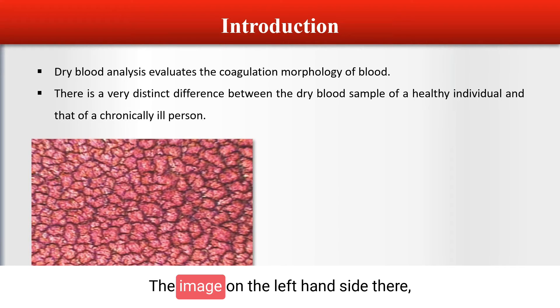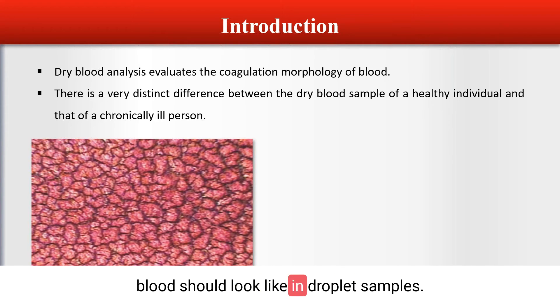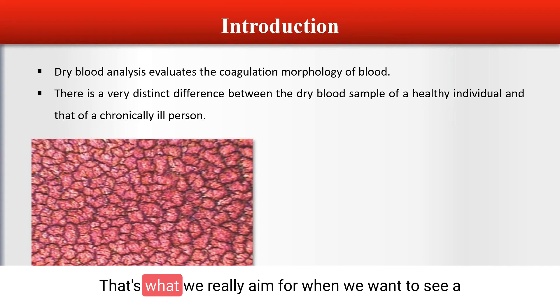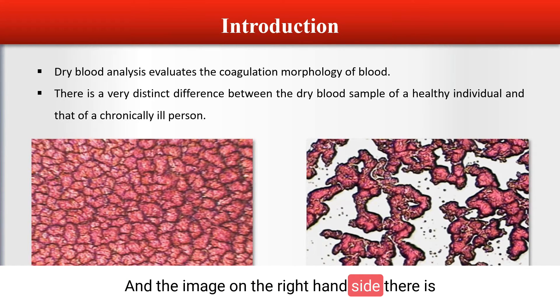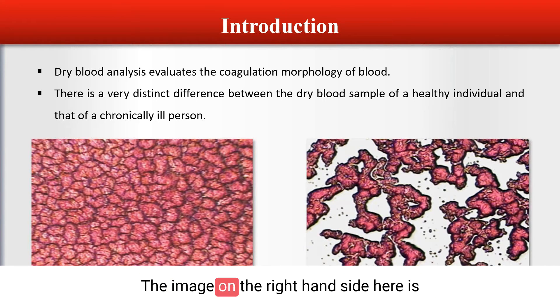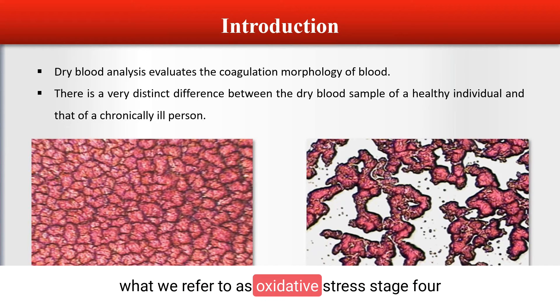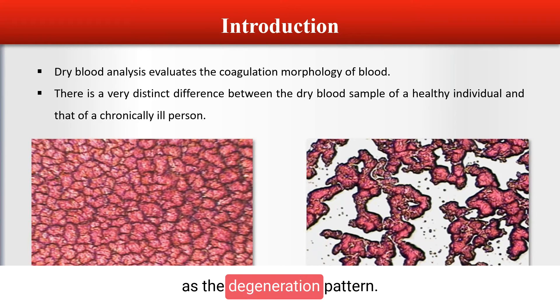The image on the left hand side is a very good example of what normal blood should look like in dry blood samples — that's what we really aim for when we want to see a healthy dry blood image. The image on the right hand side is at the other end of the spectrum, referred to as oxidative stress stage 4, or the degeneration pattern.